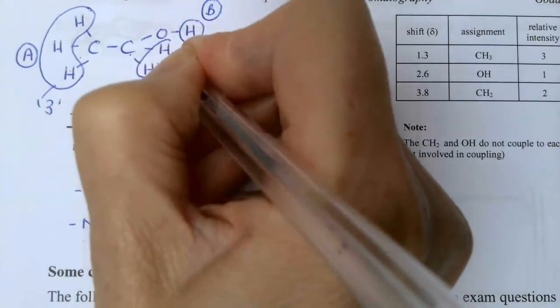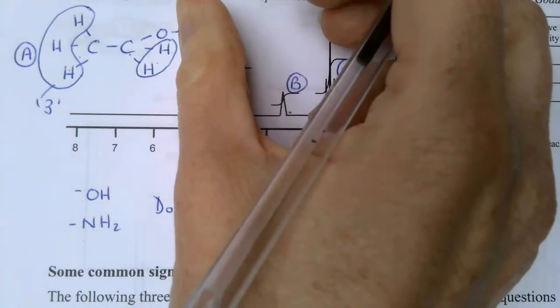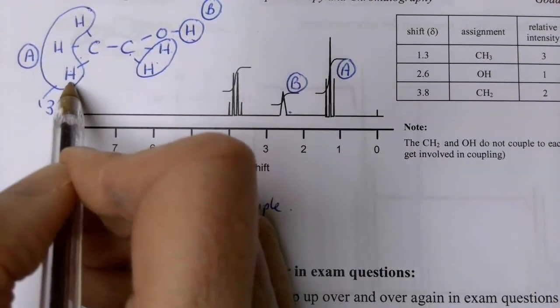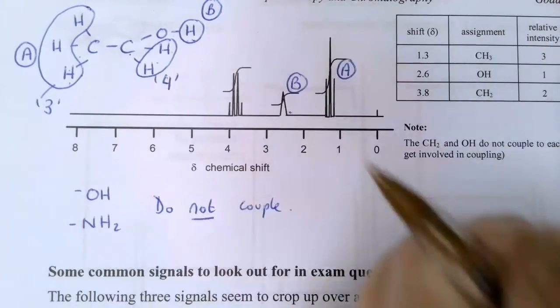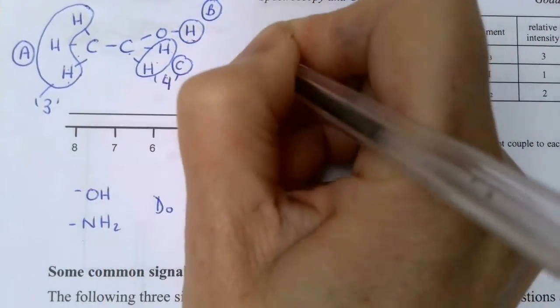So the last 2 hydrogens I'm looking at are these 2. So again, we're going to ignore this hydrogen because it doesn't have any effect on these ones. We're going to look along the molecule, and I've got 3 hydrogens on my adjacent carbon, plus 1 for myself, so that's 3 plus 1, that would be my quartet, and that is this group here. I'm going to call that one C.